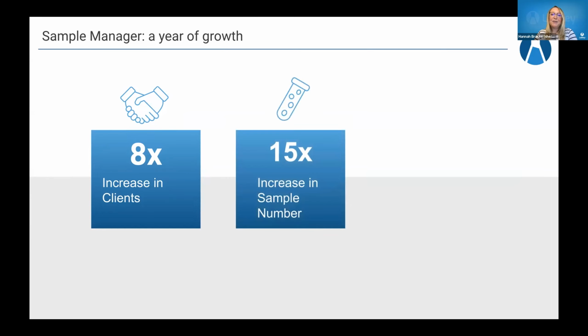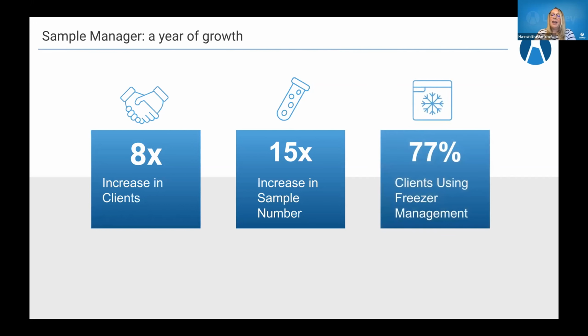We've also seen a 15-fold increase in the number of samples that Sample Manager is managing overall. And this is really exciting to see all of our clients jumping in, getting started, being able to use a tool that's very helpful for them in the lab. And these numbers reflect that. And lastly, we've got 77% of our clients using Sample Manager using the freezer management component, which was a big initiative for us last year. And so it's really exciting to see this type of adoption for something that we worked really hard on.